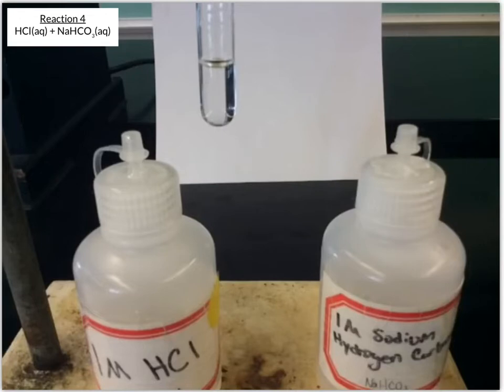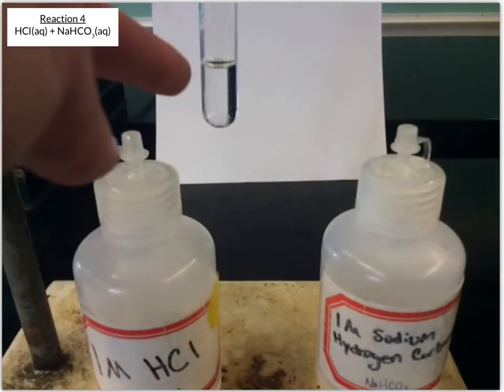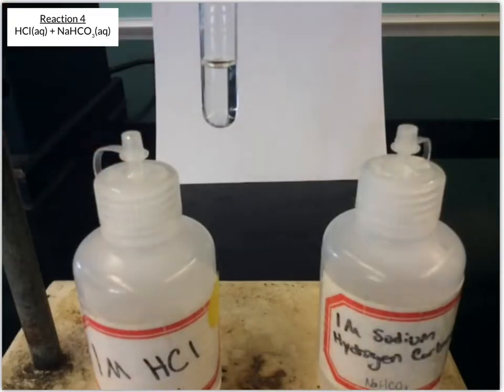Okay, so you could see when I poured that in there, it started bubbling right away. So there's definitely some sort of reaction occurring because I'm not heating this test tube. But when I poured the sodium hydrogen carbonate in, it immediately started bubbling, fizzing, and you still have a little bit of bubbling occurring. The solution still appears clear, but that bubbling indicates that some gas must be formed in this reaction.